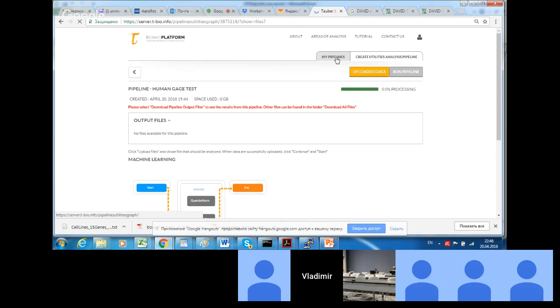the discussion related to standard differential expression analysis of RNA sequencing data. So the analysis is standard for many experimental setups.